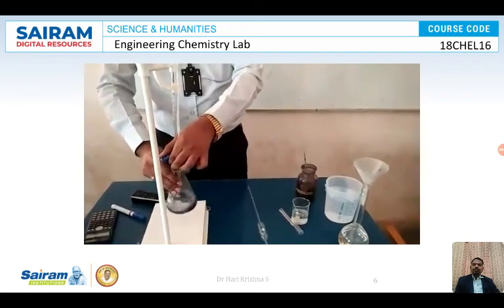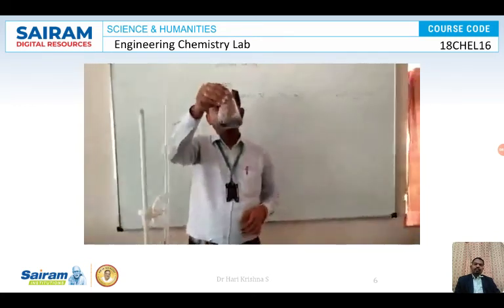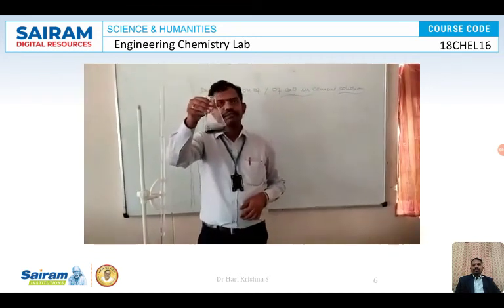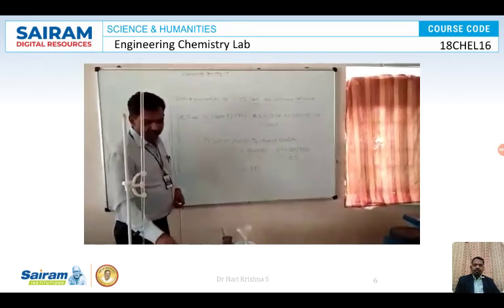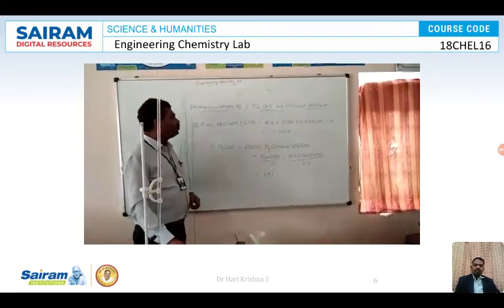Once you get this endpoint, stop the titration. The volume of Na2EDTA consumed at the endpoint is around 8.5 ml.